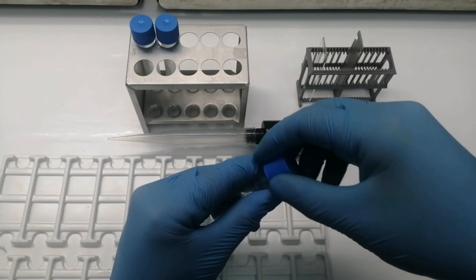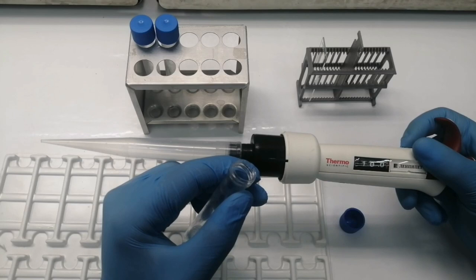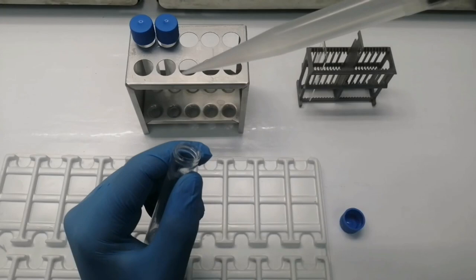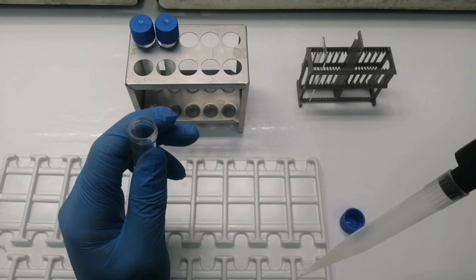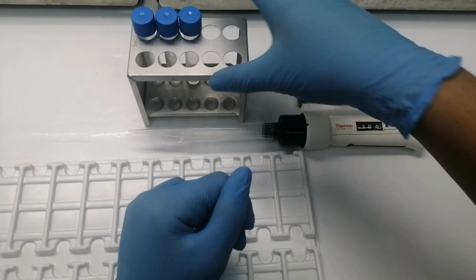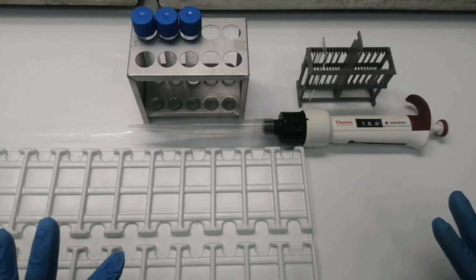First of all, we get the saliva tubes and open the tube. We use this specific instrument to calculate the amount of saliva we need — the amount of the drop — press this button, and put three drops of the saliva onto the glass slide. After that, we put it aside for one or two days to let the saliva dry.